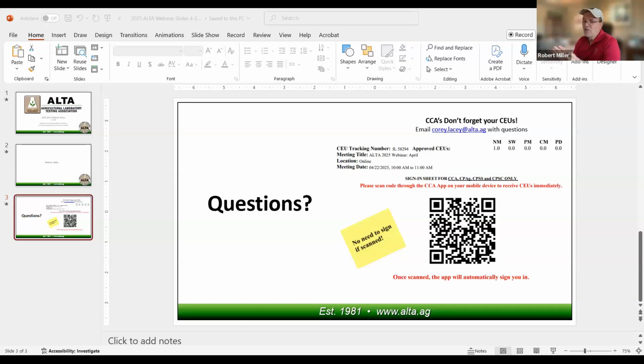And hey guys, we went back to old school. We used a granite rolling pin on a granite table, and we just kept sieving until we met each one of those parameters. The end result behind the whole thing was, if you look at this surface response that we have on these two soils, it says that if we mill our samples to a 0.5 millimeter minus, and that's 100% of the soil sample passing that, and we use a 500 milligram sample size, we can achieve RSDs of less than 1% based on 3 replications.